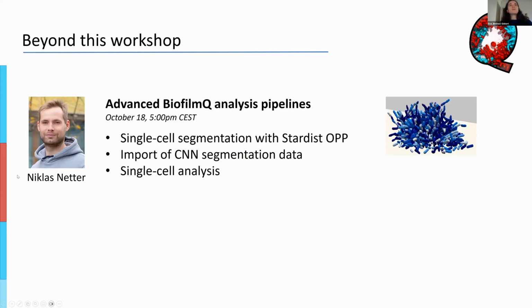And that is what Niklas is going to talk a bit about tomorrow in this workshop about advanced BiofilmQ analysis pipelines. It's going to be tomorrow at 5 p.m. Central European Summer Time. And he's going to talk about single cell segmentation with an example, StarDist OPP, as an example of a neural network for image segmentation. This is one that we have also developed in our lab.